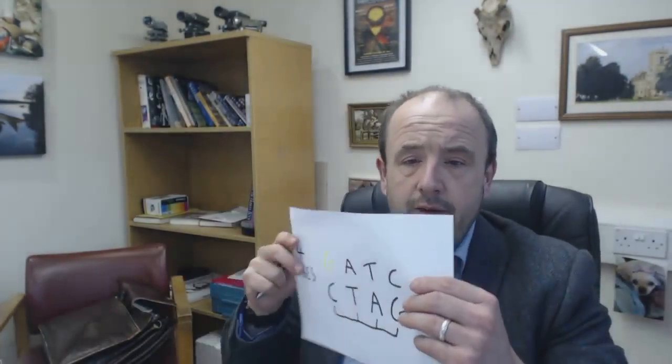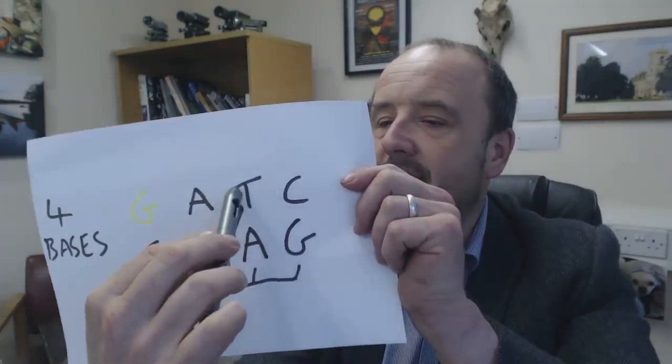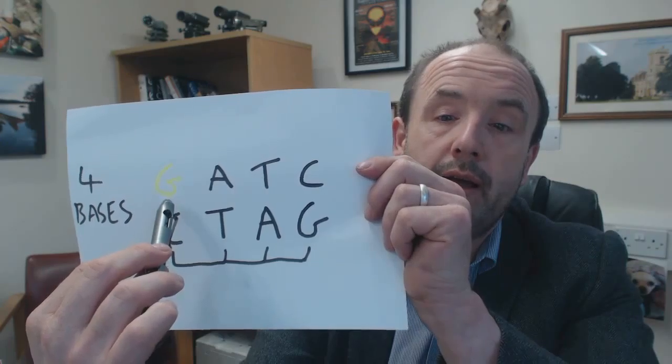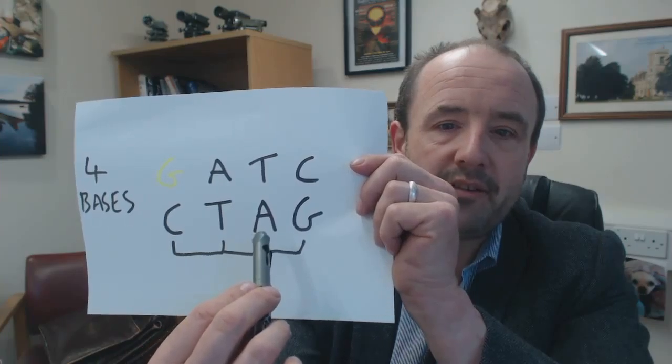Then finally, in this final example, we have a C, a T, an A, then finally we have the fluorescent G joining here. And so in this example, we now have a molecule of 4 base pairs in length. So that's what happens in the sequencing reaction. How then do we decipher the genetic code? How then do we decipher the sequence of bases in our gene of interest?